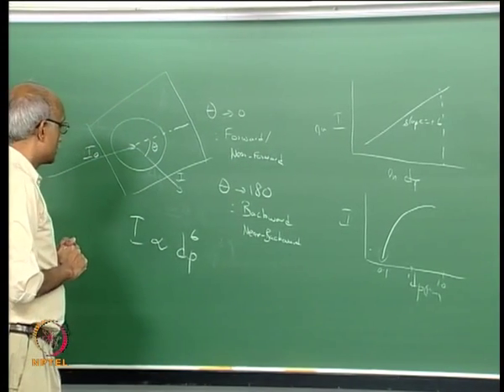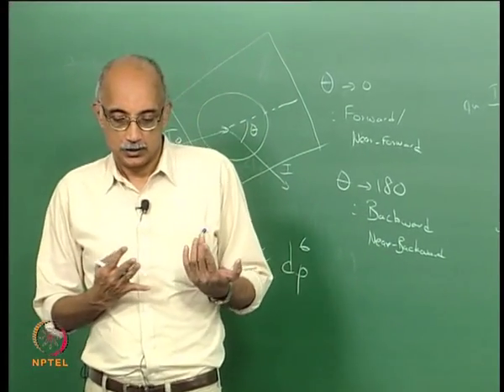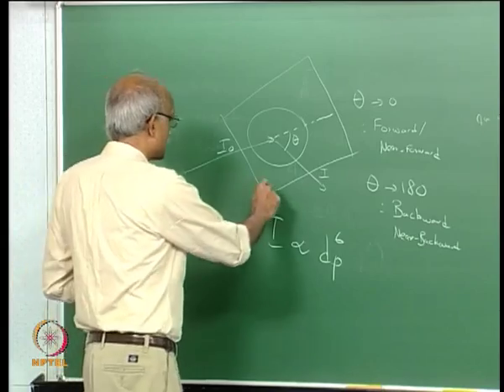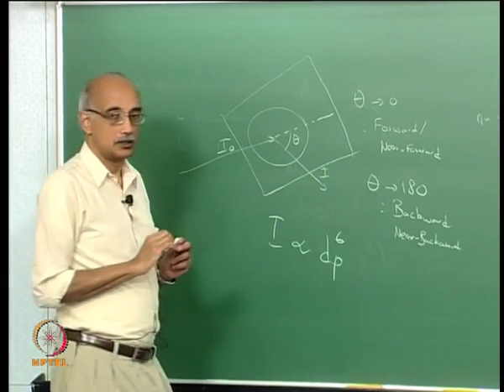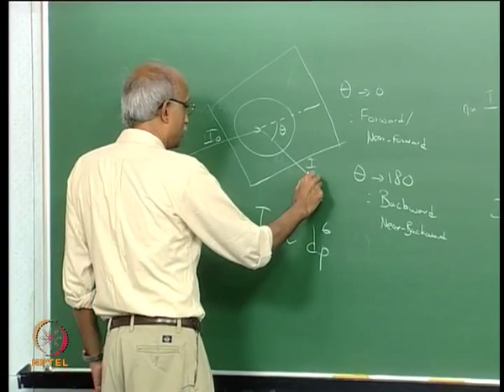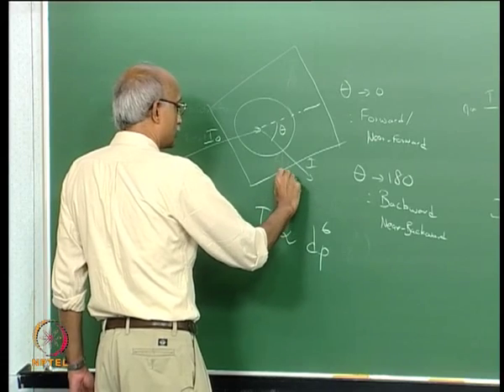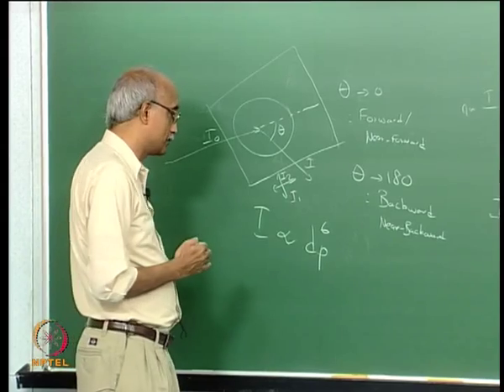So as you know, light is polarized. So if you have a polarized light, it will have two components. And when you have scattering going on and you define a scattering plane, this scattered light can also be essentially deconvoluted into two components. There is one component that is parallel to the scattering plane, and that's called I2, and there is a component that is perpendicular to the scattering plane, that's called I1.